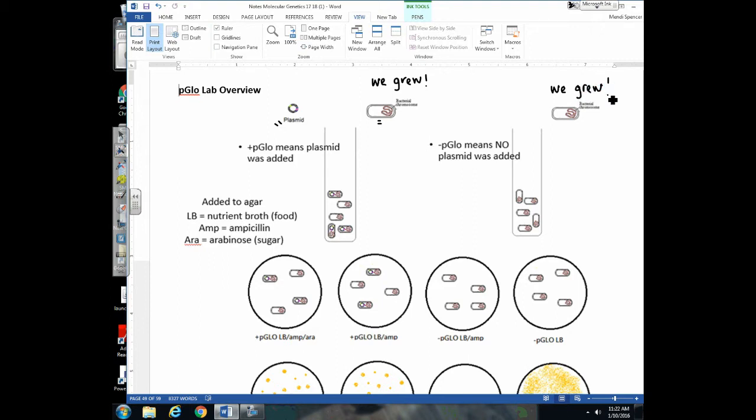And that was to help you practice some of these techniques related to growing bacteria. But remember, the plasmid was from Bio-Rad. So you understand, we didn't engineer this recombinant DNA. We're just simply going to try to insert it, or transform bacteria cells with it.